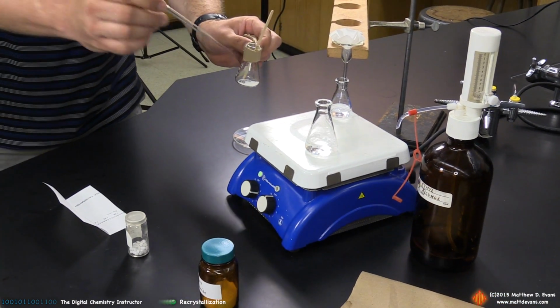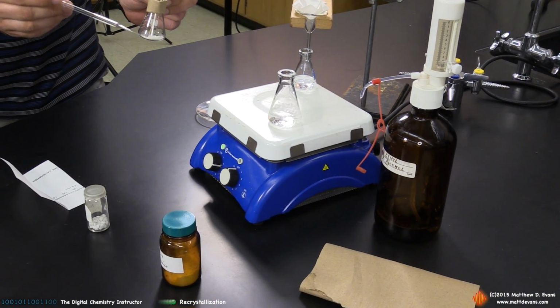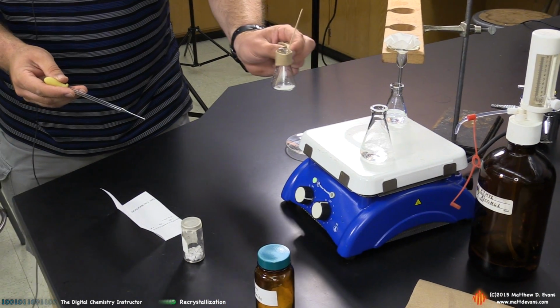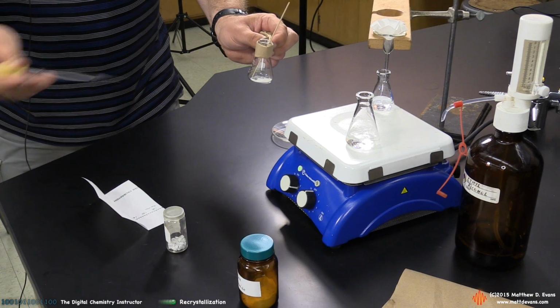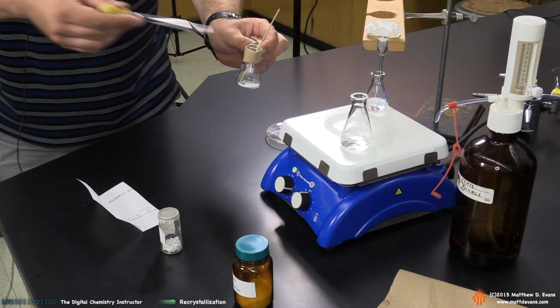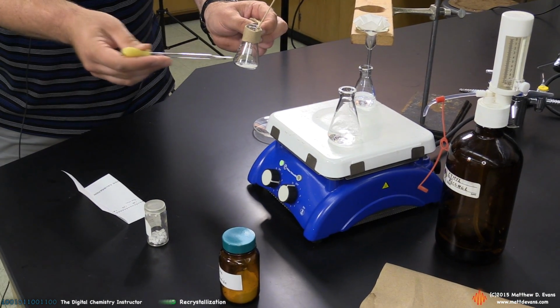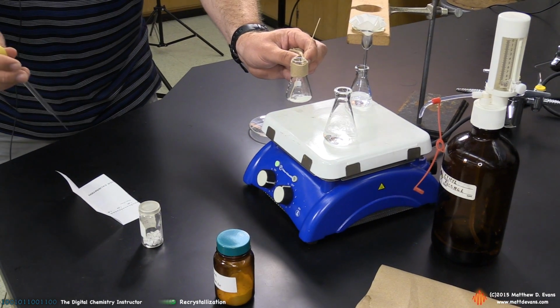The idea here is I'm just going to cover the solid with just enough hot solvent to cover these crystals, and then I'm going to get it on the hot plate. I want to keep it in contact with the hot plate at all times while I'm swirling. And I want to keep adding hot solvent every 10 seconds, and I don't want to slow down because if I slow down too much, the solvent is evaporating quicker than I'm adding it. So I'm going to add just enough hot solvent so that I see all the crystals are entirely dissolved. That's what I want. That's my goal.